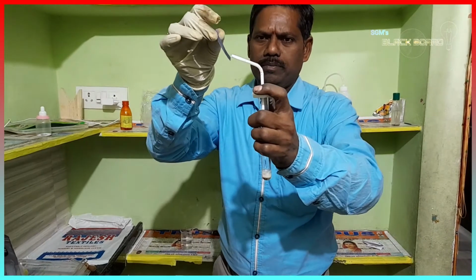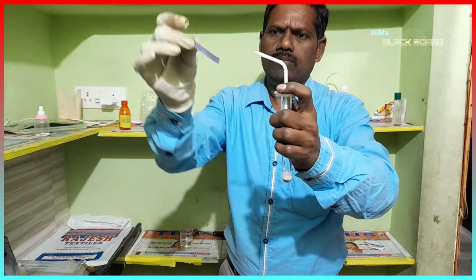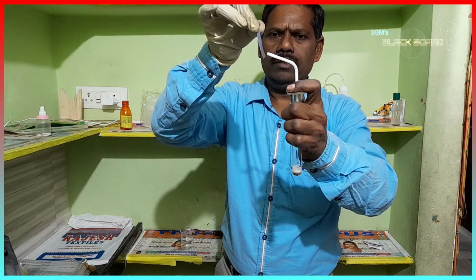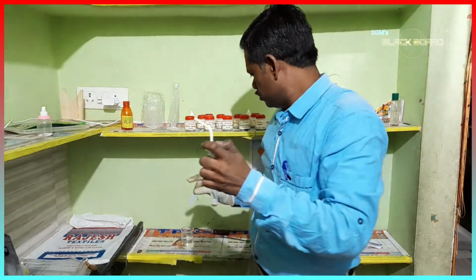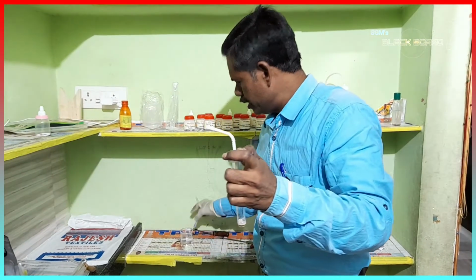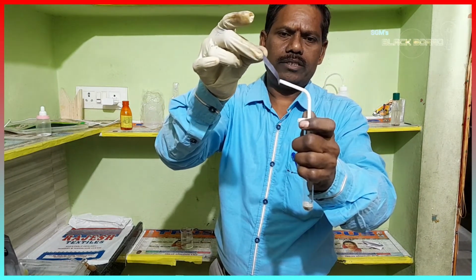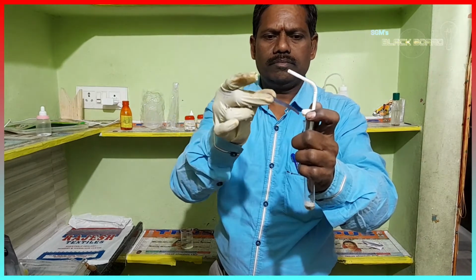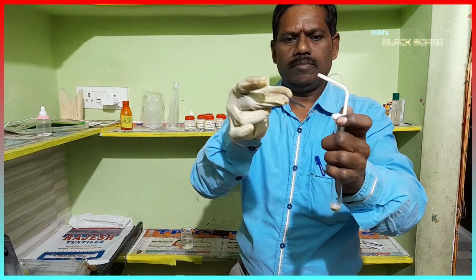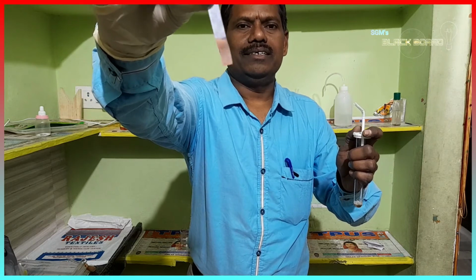This is blue litmus paper. See, is there any change in color? No, there is no change in color. Now I will dip this into the water, so I am taking a wet litmus paper. Now I will put it in front of this gas. See what happened here? It turned red.